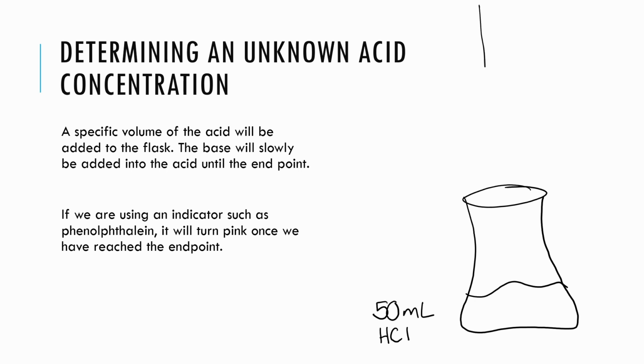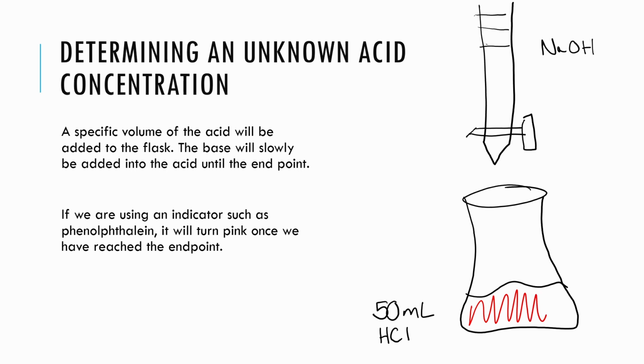Then we'll have our burette up here. And that's my little drawing of a burette. And as we go through, we will have sodium hydroxide up here. We will need to know what the concentration of that sodium hydroxide is. And as we do our experiment, we will use more and more sodium hydroxide, and we continue doing this until this turns pink down here. I know that looks a little bit red, I don't have a pink pen here, but we're going to pretend that that just turned pink.